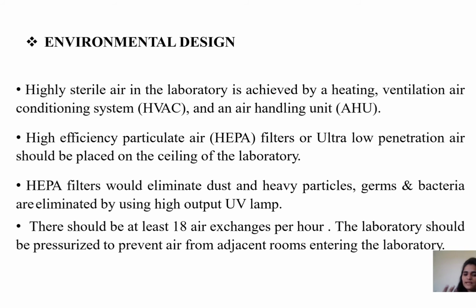HEPA filters would eliminate dust and heavy particles, germs, and bacteria, which are also eliminated by using a high output UV lamp. According to the period, we have to call engineers and always check for the testing of the lab, and the HEPA filter must be changed. There should be at least 18 air exchanges per hour.